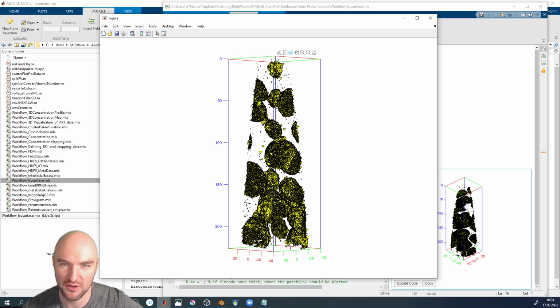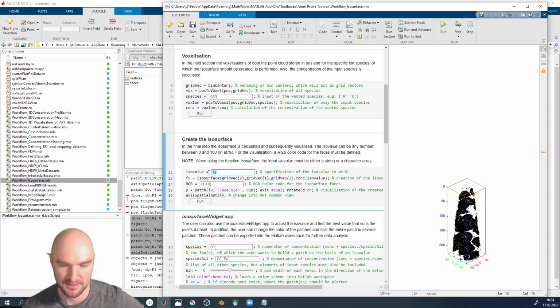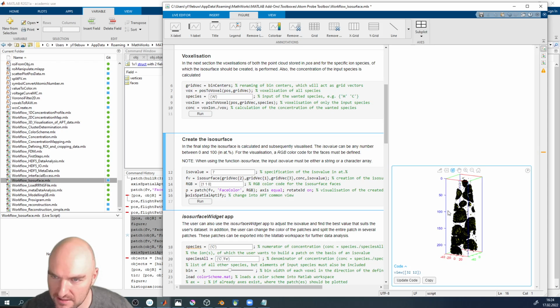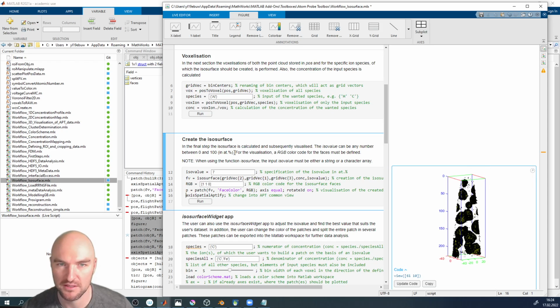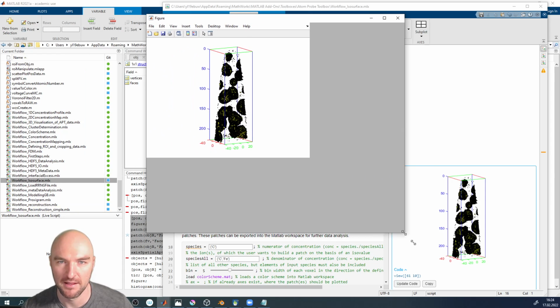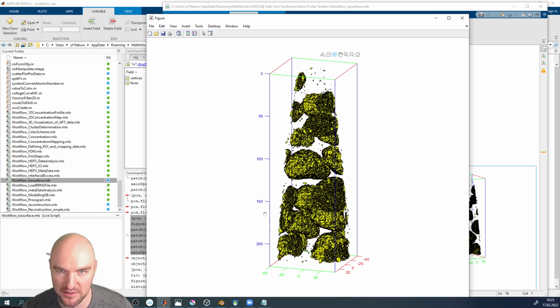And we've created a lot of internal vertices, so maybe that was already a bit of a high value. Maybe we'll need to go to a little bit of a lower value. I think 7% was something that we had before, because obviously already in the precipitates the value was a little bit low. So let's have a look at that again. Essentially we've created isosurfaces inside the precipitates, which is definitely not something we want to do.